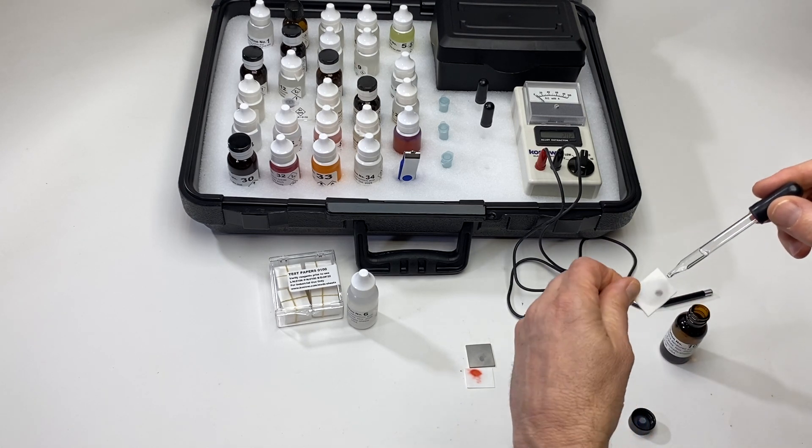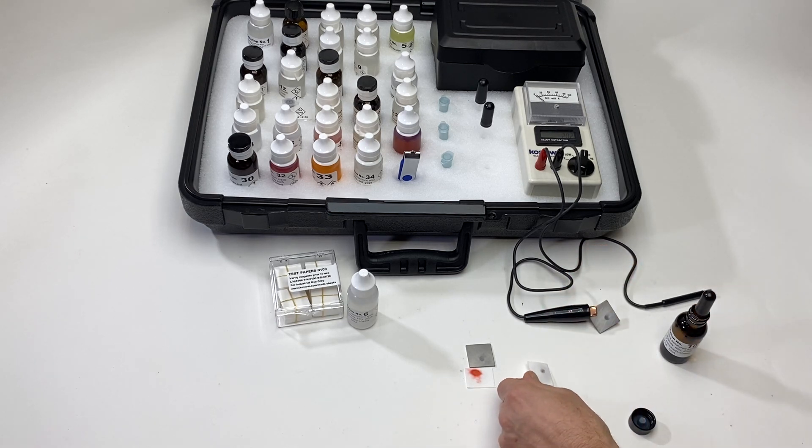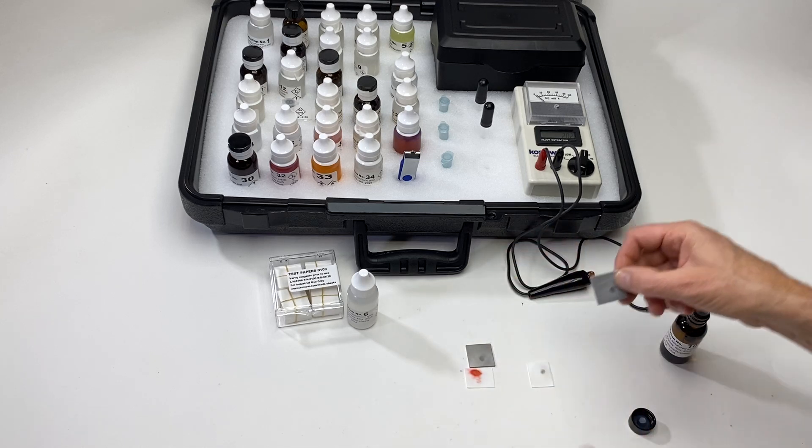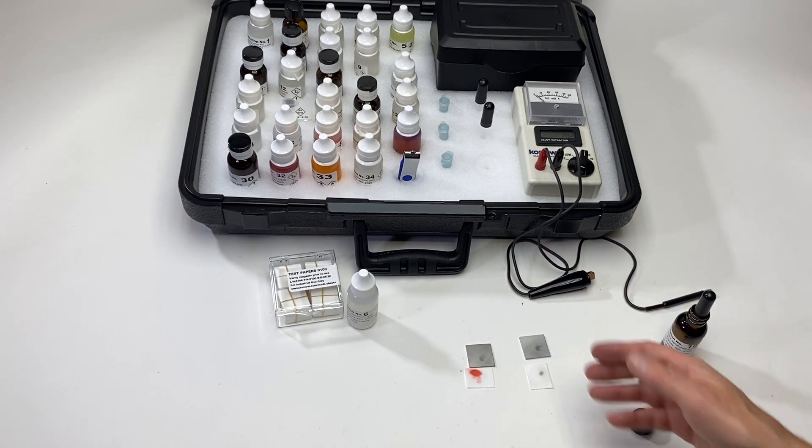That's funny — no color on this one. I'll leave this result over here. Even with multiple drops, nothing is happening. So that's the difference between one metal and another metal.